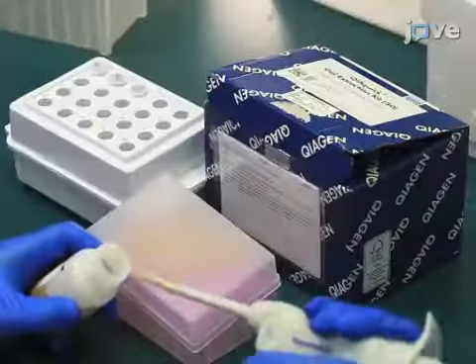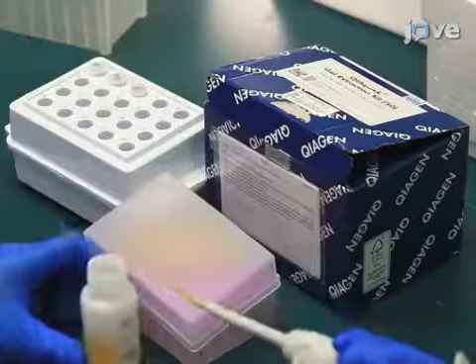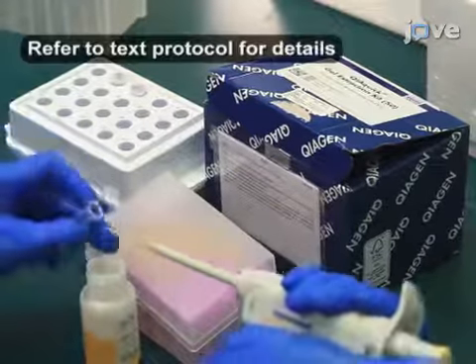Next, use a DNA gel extraction kit following the recommended protocol to clean the PCR product. Then, perform sequence analysis according to the text protocol.